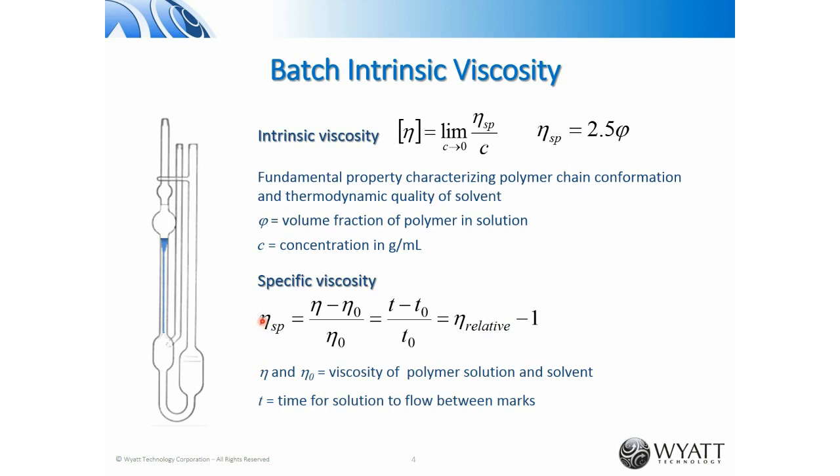Now the specific viscosity, as defined, is proportional to concentration. So more traditionally, people divide out the concentration dependence by computing the intrinsic viscosity, which is the limit of the specific viscosity divided by the concentration as the concentration goes to 0.